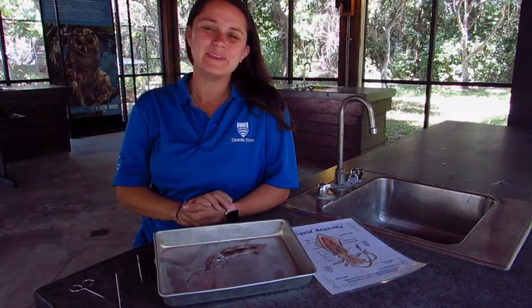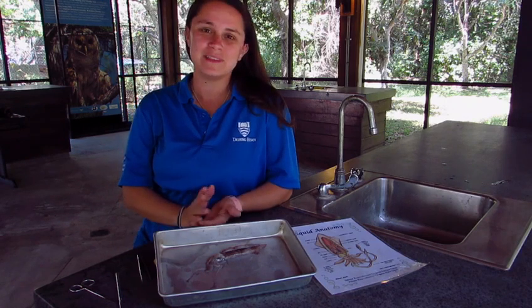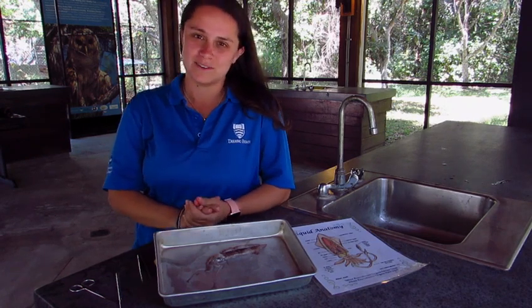Squids are cephalopods, meaning that they're head-footed, which means that their head is attached to their feet, or in this case, their tentacles.